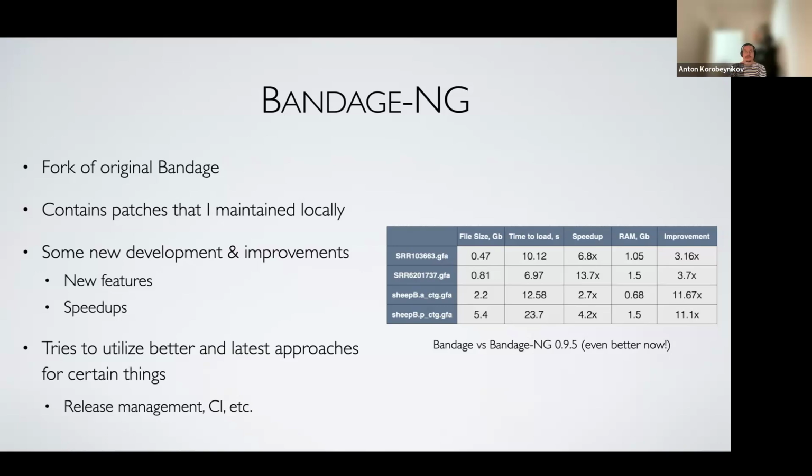So yeah, and motivated by all the metagenomes and all the T2T consortium needs, I try to optimize as much as possible in terms of memory consumption and time to load. Sorry, I was a little bit lazy to do up-to-date benchmarking, so I just pulled some old table.